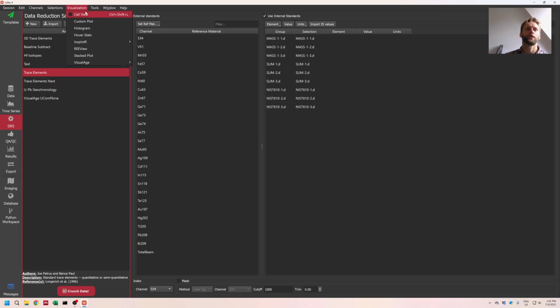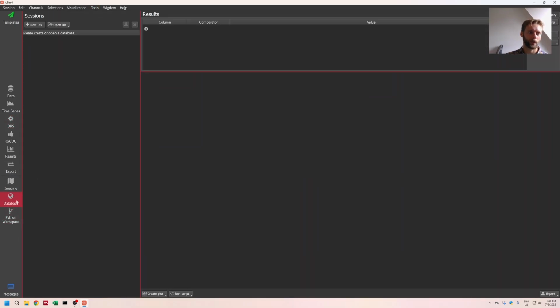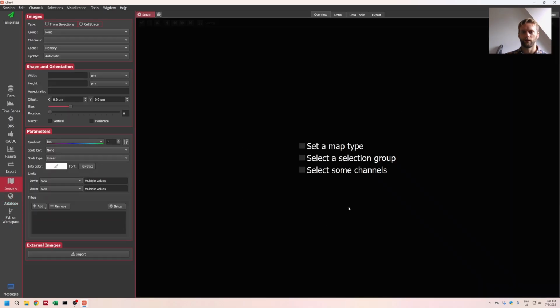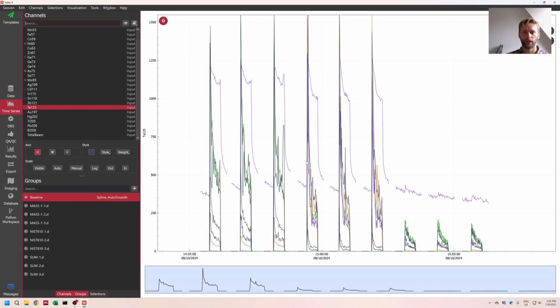Yes, and there's so much more inside this program. I mean, there's an Iolite console, a Python console that you can work in here. You can make maps with it. There's all kinds of stuff that you can do in Iolite. So the sky is really the limit. But for now, let's just focus on turning our spots into good data. And that's what we tried to do here today. Let me know if you have any questions, and good luck.